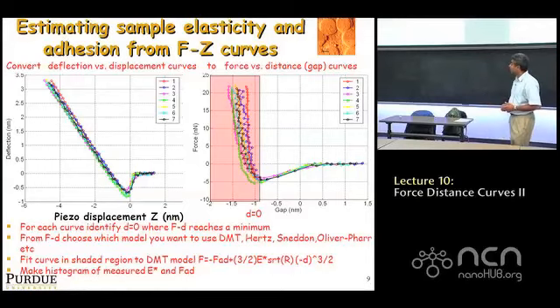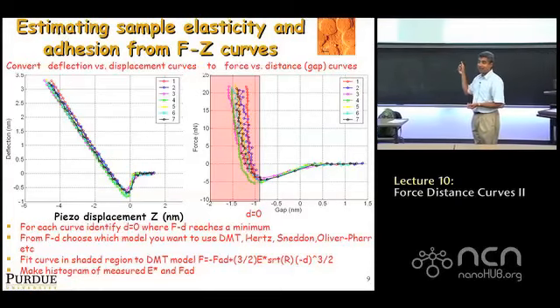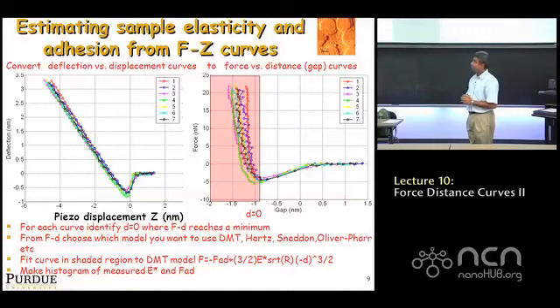Okay, so this is very important, and in your homework problem, you're asked to do this. We'll actually give you data on exactly this composite material, and you're going to be asked to back out the elastic modulus from it. So FZ is what you observe. You have to convert to FD. And from FD, you have to set D equal to 0 and then do a best fit to some model and get the elastic modulus of the polymer that resides in between the carbon fibers.